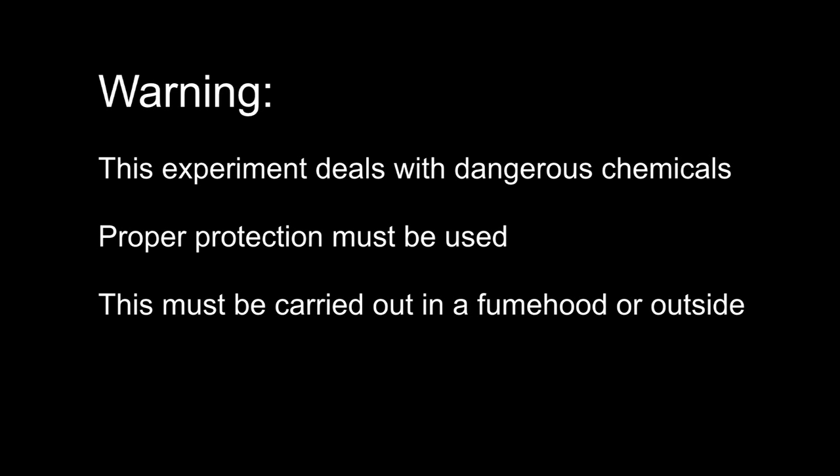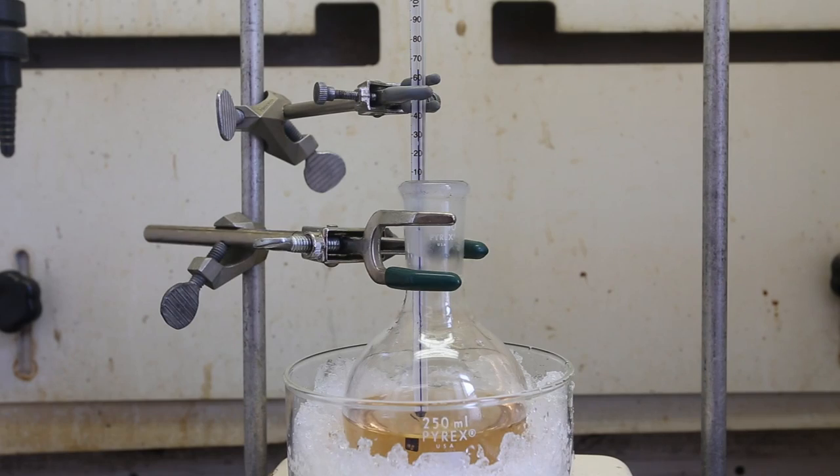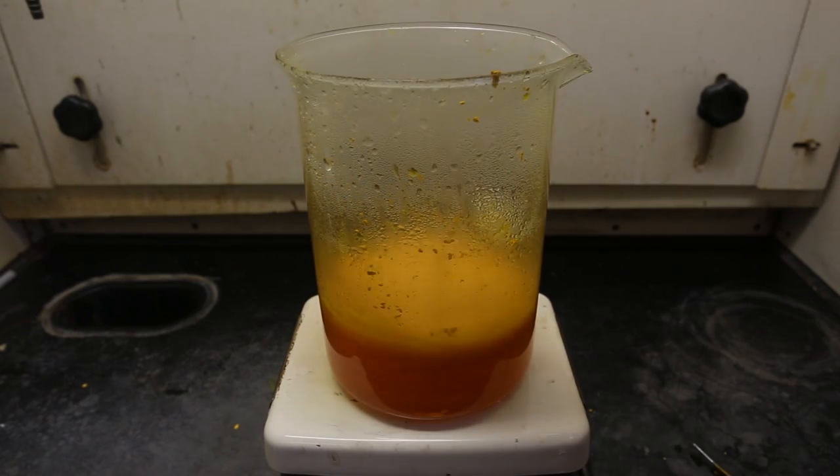This experiment deals with dangerous chemicals, and proper protection must be used at all times. This experiment must be carried out in a fume hood or outside. The main use of P-Nitroaniline is as a precursor for a dye. However, a more interesting use for P-Nitroaniline is not as a dye, but in a reaction with sulfuric acid.